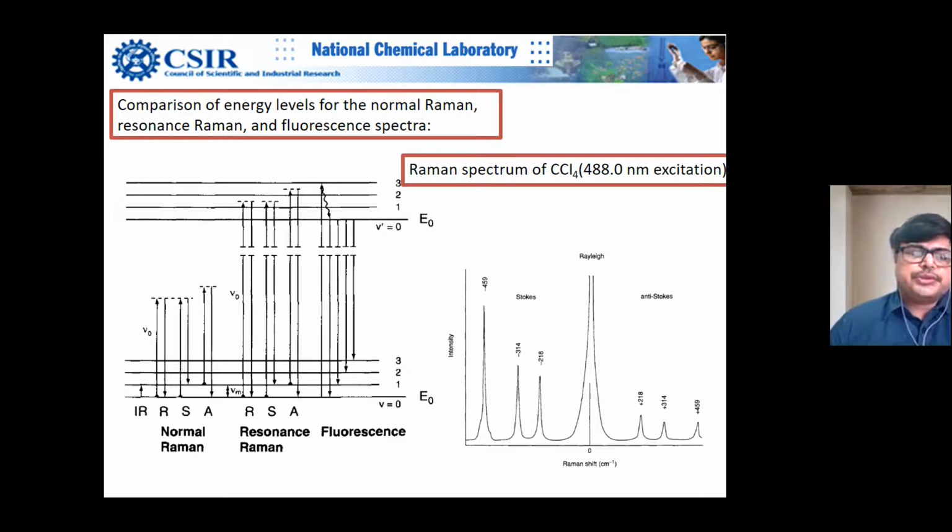So basically Raman spectroscopy can, in principle, be done with any frequency or any wavelength source. The reason is that you don't need to excite the electron to a higher energy state. So here we see the virtual state. The electron goes there when the electron cloud interacts with the incoming photon. This is nu zero, the frequency of incoming light. So it goes to the virtual states actually.